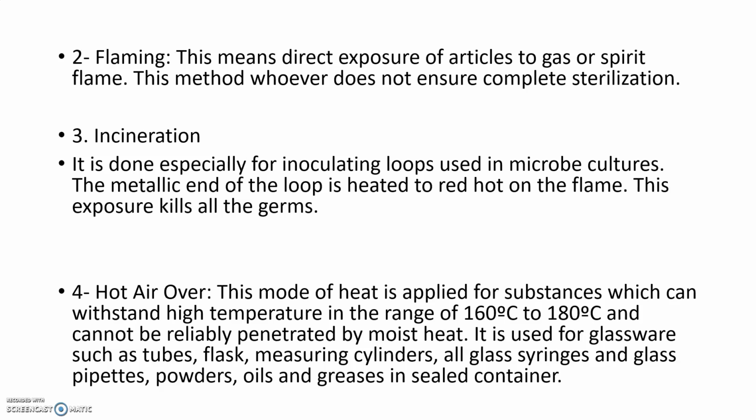The next coming is hot air oven. This mode of heat is applied for the substance which can withstand high temperature in the range of 160 degrees Celsius to 180. I think you are very familiar with hot air oven, but I am just saying a few words.